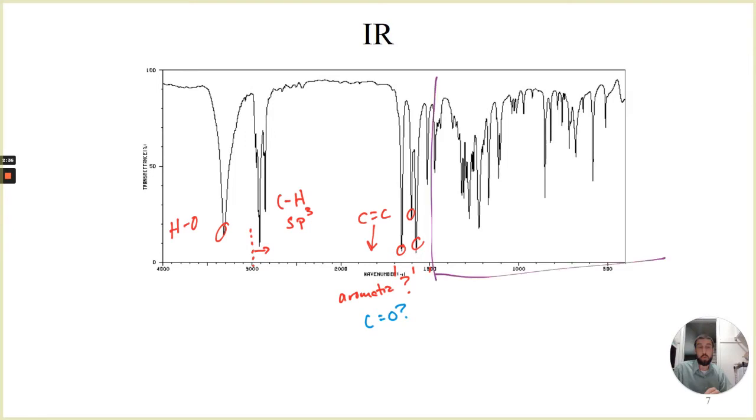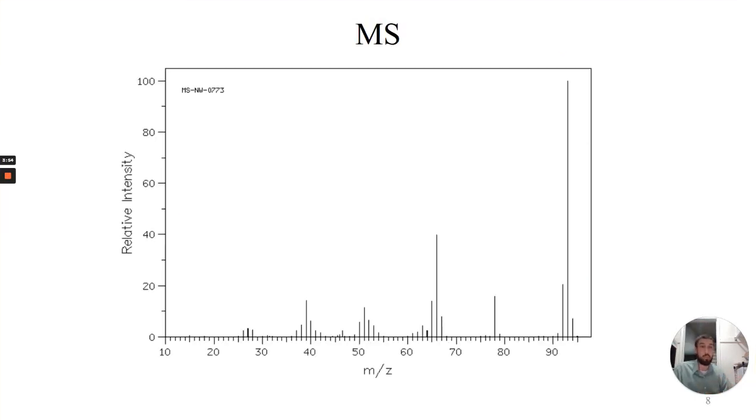This whole region is dodgy to analyze. I would go almost as high as that 1600 range to be dodgy to analyze because it's easy to overanalyze it and say there's 500 million different things in there. It's the fingerprint region. Stay out of it if you can. With that, we can say, cool, good job. Move on to the next one.